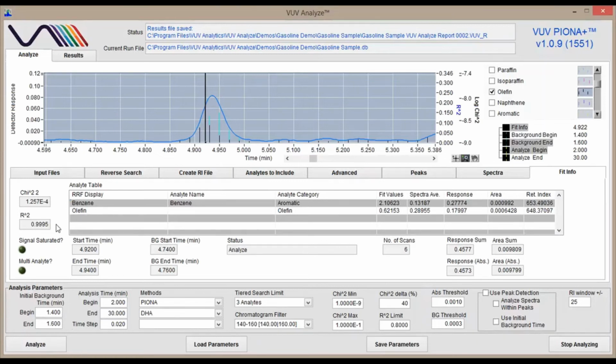You can set a threshold that will cause the software to reject fits that are below the threshold, and it'll report the total rejected compared to the total response in the form of a percent. And if an unordinary amount is rejected, like say more than 1 or 2% in an analysis, that's a potential flag to check out the analysis or the measurement itself. So it gives you an automated verification metric, which would not be possible with an ordinary FID response or other non-spectroscopic response.